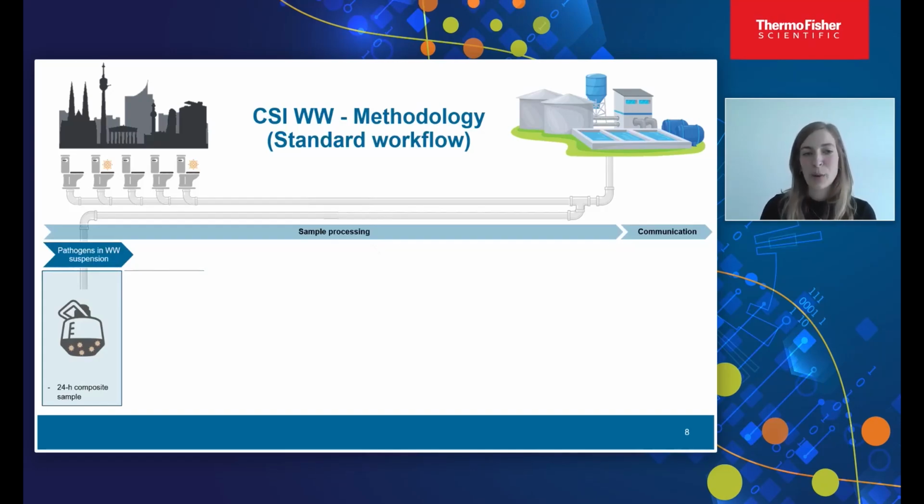We get a 24-hour composite sample, which includes the different viruses. The good thing about this is that we don't just cover the entire city, we also cover an entire day. This is why we do this 24-hour composite sampling.